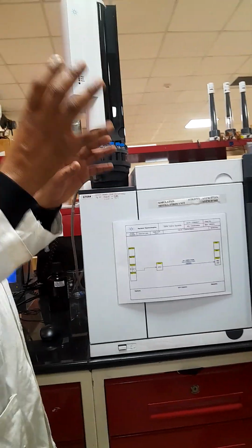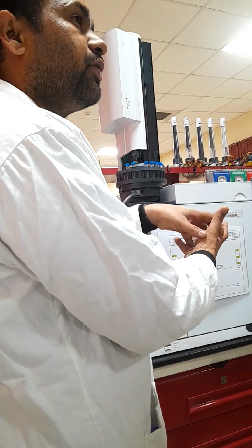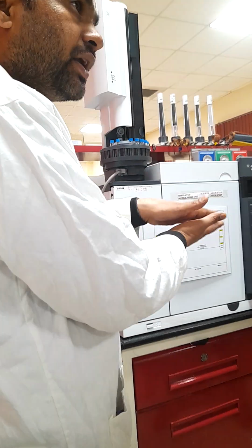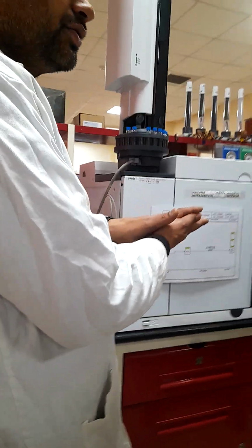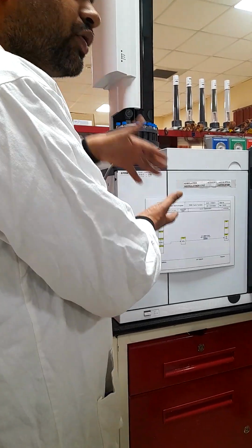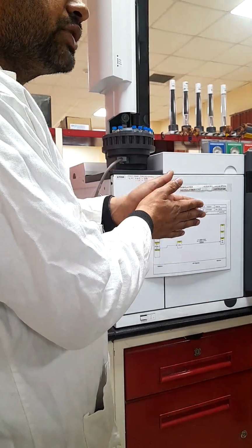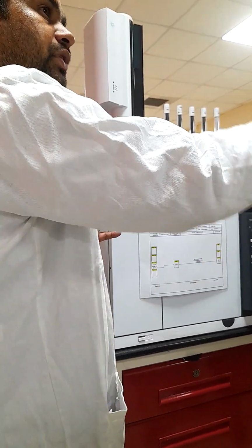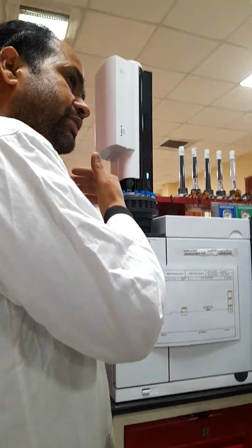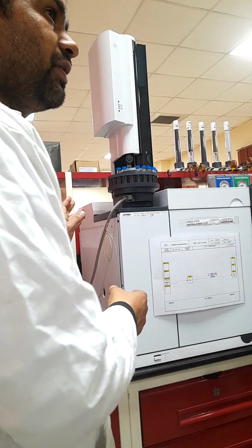Polarity. There are some chemical terms here. You can discuss all together how polarity will affect the attachment of your molecule here, because it is not permanently attached. Some terms are absorption and adsorption. These are some basic terms. Whenever the molecules come, it will act like dissolves like. Means if your column is polar, polar molecules will attach and non-polar will move away. Similarly, less polar also will follow. So whichever has less polarity will go first.